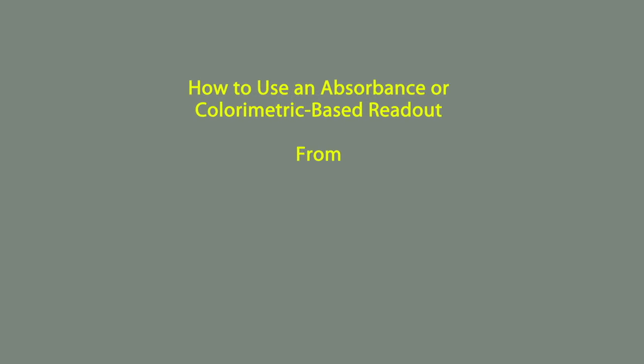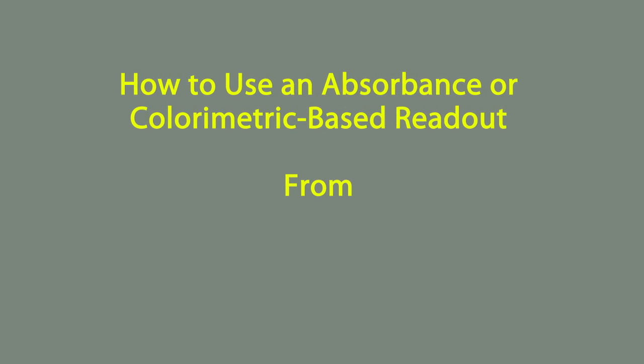This tutorial describes how to perform any absorbance or colorimetric based assay from preferred cell systems. This readout or endpoint is incorporated into all of the HemoLIGHT, ImmunoLight, MSCLight and STEMLight assays. If you have followed the tutorial on measuring fluorescence, you will notice that there are many similarities in the absorbance readout protocol.